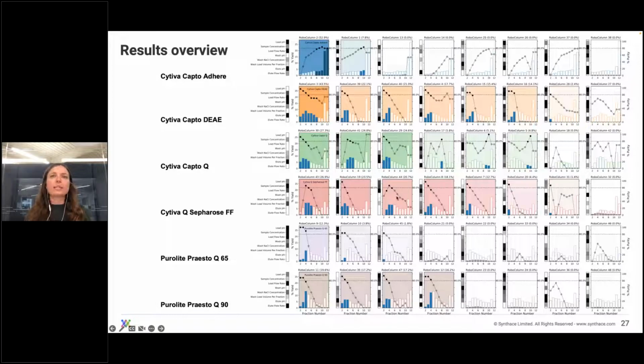And so you can see clearly that for some conditions, we really didn't hit the jackpot. They didn't perform so well. But likewise, we were able to identify conditions which really weren't so bad. And so when designing further DOEs, this would perhaps be a good place to start.